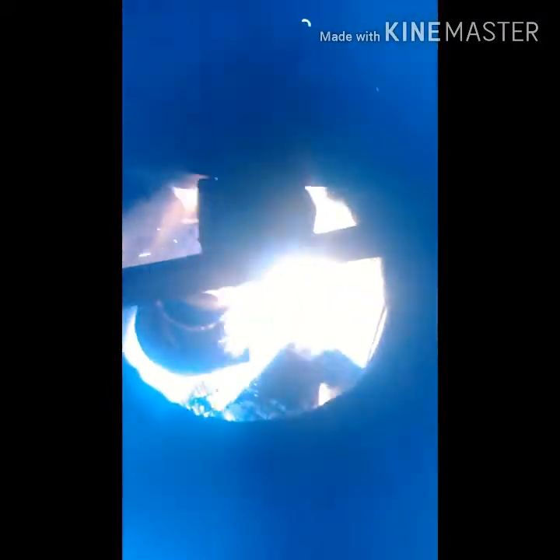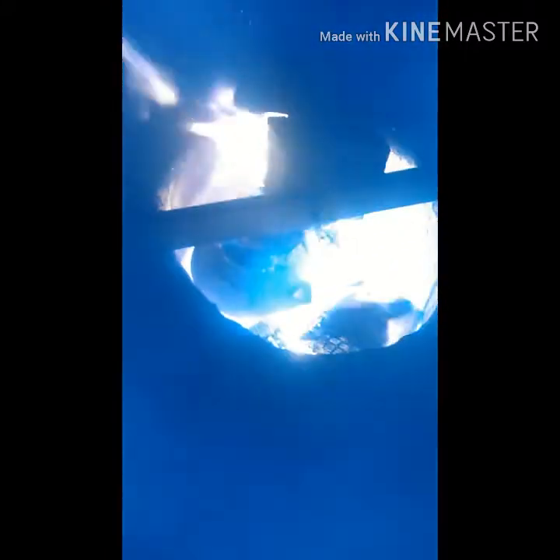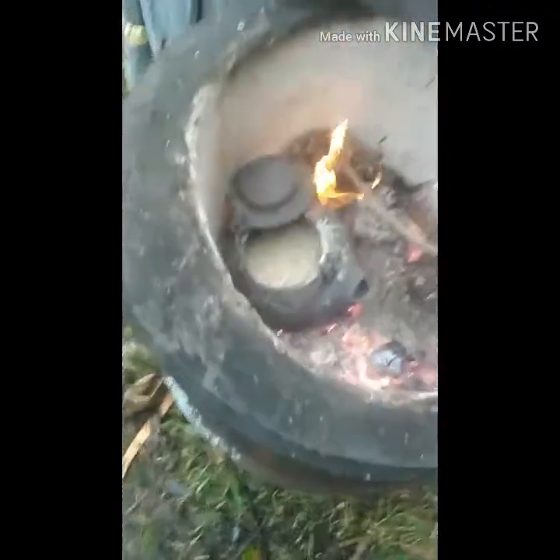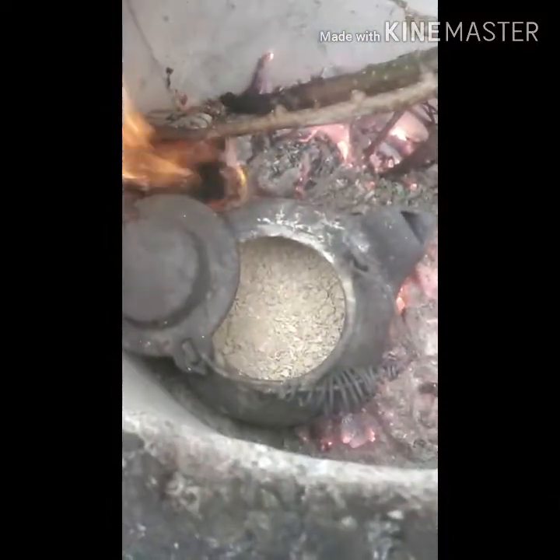It's in the fire nice and hot — the bottom of it's pretty pink or red, though the camera doesn't really show it very well. It's been in there for about half an hour to 45 minutes so far.